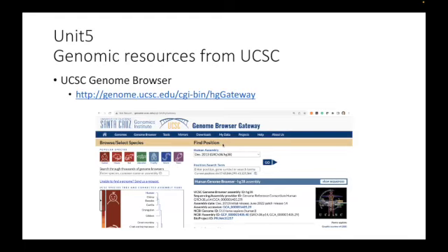When you actually write a paper or manuscript, we say, okay, here is the BRCA1 sequence according to UCSC version something. As long as you specify that level, and for the BRCA1 sequence in Ensembl, which version, we use BioMart with that command. When you provide that much detail, then we can verify whether you did it correctly or not, and then we can reproduce it.